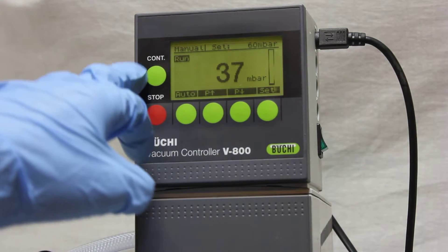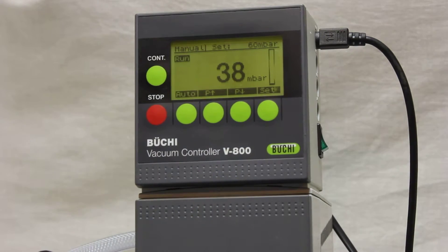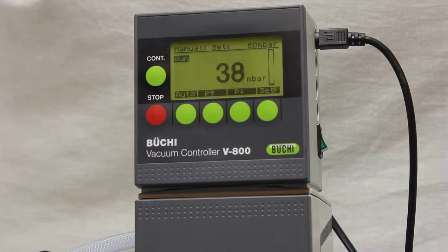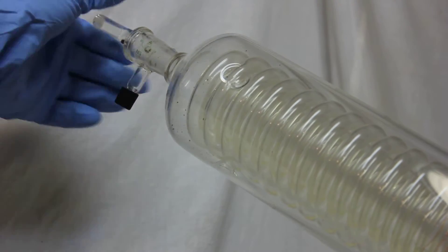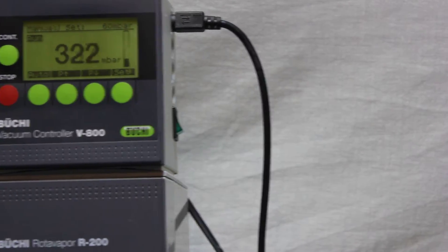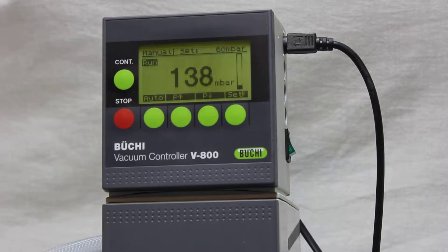Instead of just turning it on, I'm going to set it to auto. Because it's already below the requested vacuum, the pump is not going to work. As long as the pressure is already at the set point, the pump stays off.